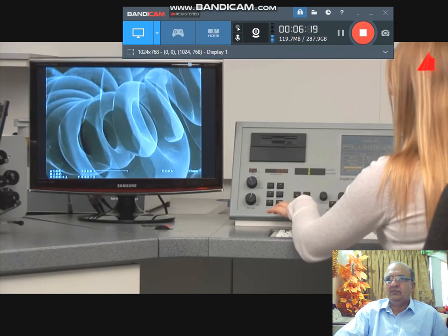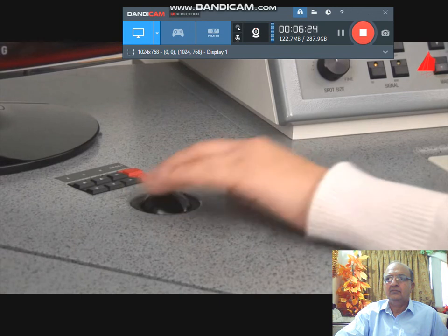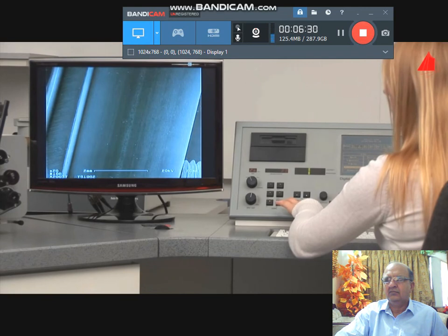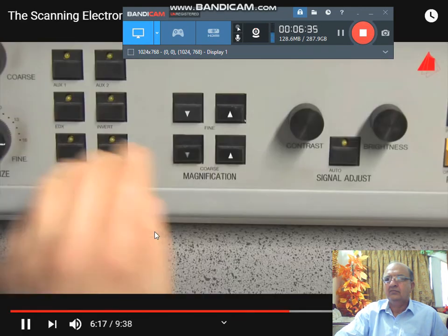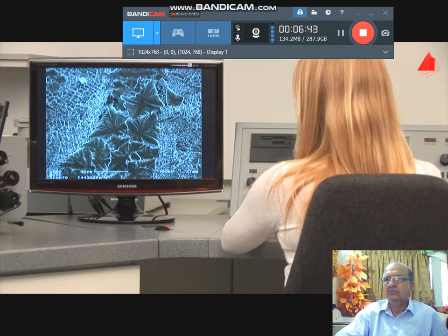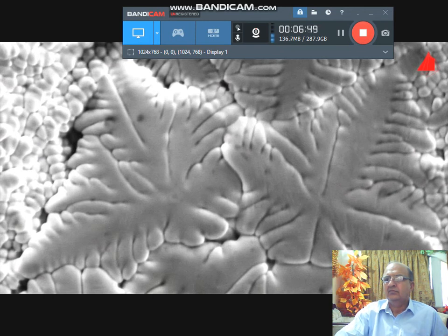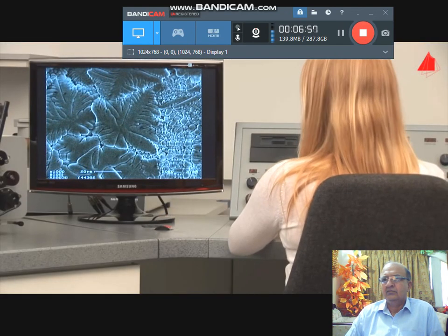Back in reality, the material tester selects low magnification again and looks for the second sample. It is an austenitic stainless steel tube with a longitudinal weld. Invisible to the naked eye, the scanning electron microscope reveals fantastic crystals. They have grown near the surface during solidification of the weld deposit. In some crystal directions, the solidification rate is particularly high and so-called dendrites form. Dendrites are crystals with many branches and tree-like shape. On the surface of the weld, they could grow almost freely without much disturbance and can now be observed well.